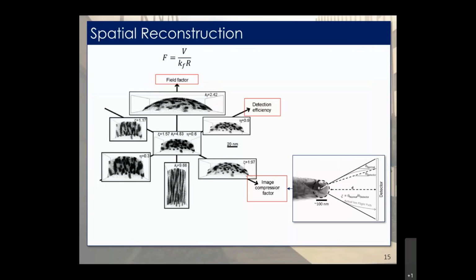And you can extend that concept forward, which is to say, if I just want to know composition, maybe I don't need an absolute, atomic scale perfect spatial reconstruction, because I know that, even if I'm a little bit off, the composition will remain the same. But if you were interested in different spatial factors, then you would need a better reconstruction.